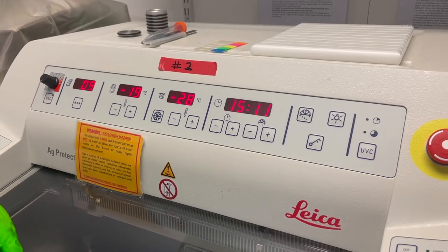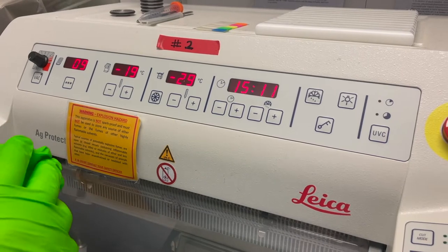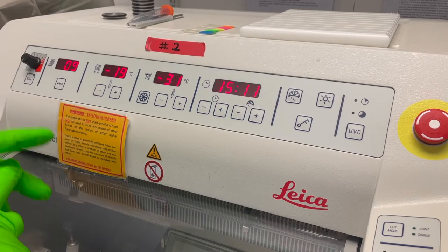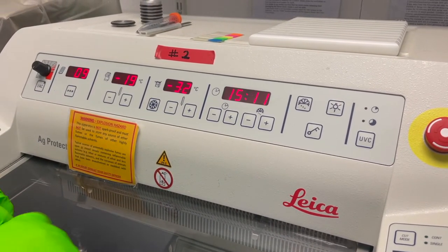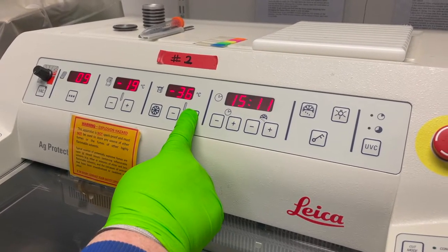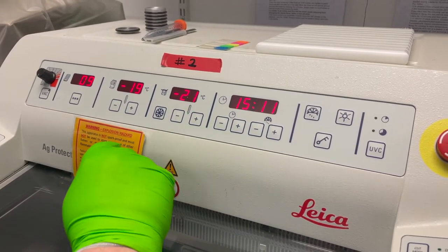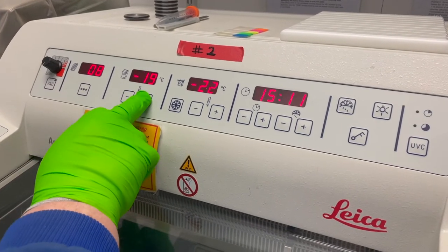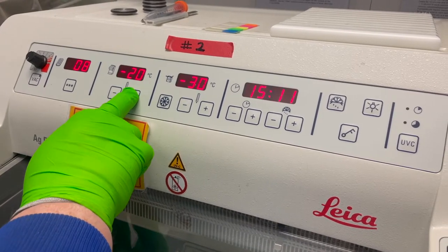If you wish the cryo chamber to be colder, you're going to have to come in in advance and pre-chill it or use some dry ice. So I don't want to work at minus 32, I'll warm that up to about minus 22. And I'll reset this to about minus 20.